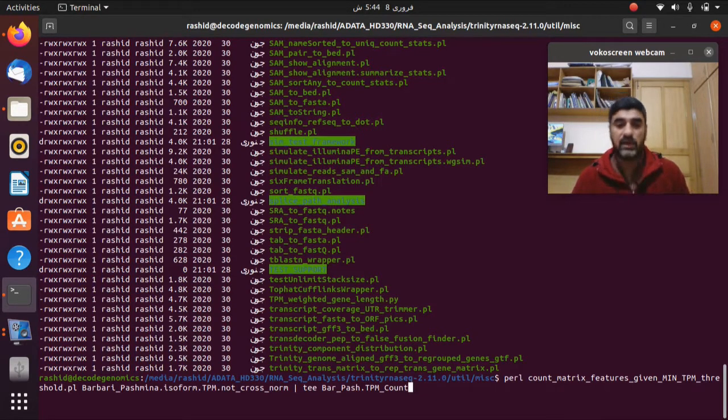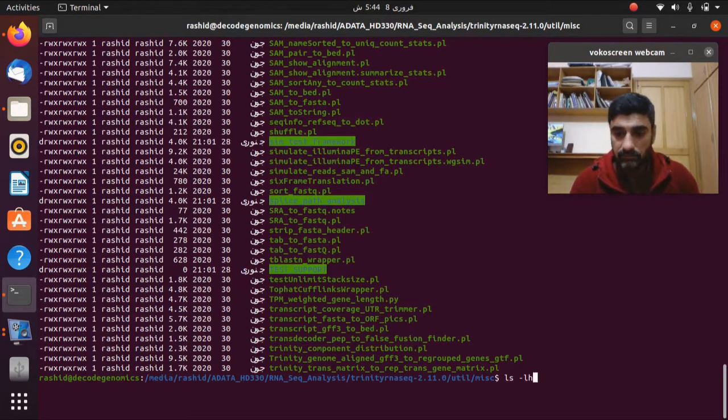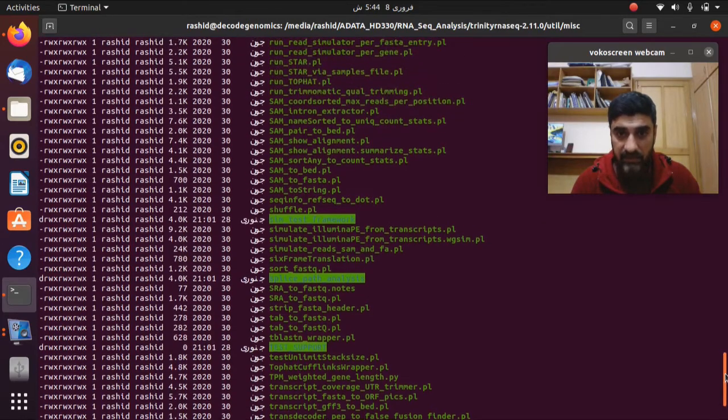So we are going to normalize. I have already run it before, so I will show you the file that we have generated after the successful completion of this command.